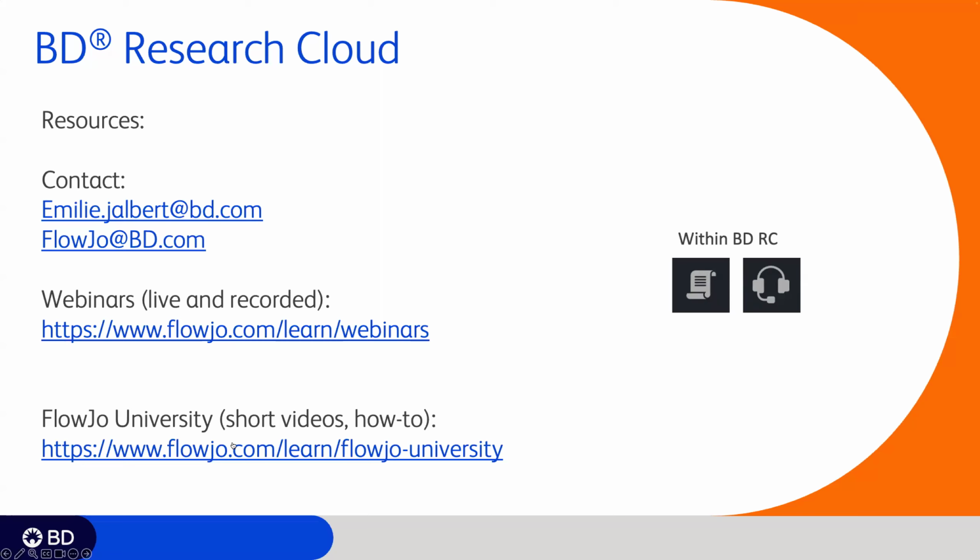And at FlowJo University, there's short videos on how to, so how do you create a panel in BDRC? How do you create a FACSDiva experiment? So they're bite-sized, shorter videos that just walk you through specific features. And also within BDRC, we have the tutorials and tech support as well. So let's hop over to the demo.